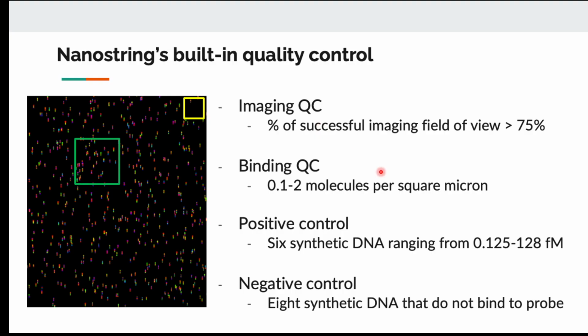The other two steps are how we can normalize the intensity, the numbers. Even though this is the most accurate measurement, the number of molecules, we're going to have to accept that not all RNA is going to bind to the probe and show up here. Otherwise, we're going to have millions of fluorescent signals, and we cannot count them. We cannot decode them all. So in this case, only some part of the molecules will be bound, and the signal will be shown. So we are kind of subsampling. We are going to sample only part of the molecules, so there can be some randomness.